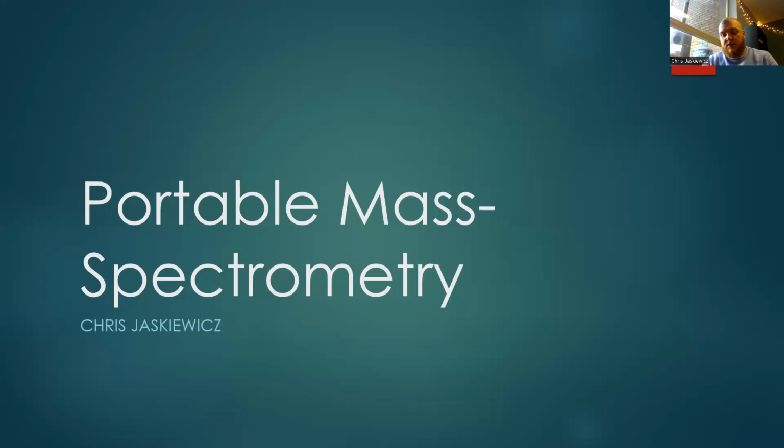All right. So I wanted to take this time and go over some new technologies I've been looking into. And for today, I'm going to be talking about portable mass spectrometry. So we're taking this analytical technique that we know and love in the laboratory as mass spectrometry, and taking that out of the lab and trying to see if we can integrate it into a way that's plausible to be applied in field, giving us better real-time analysis of substances and material.